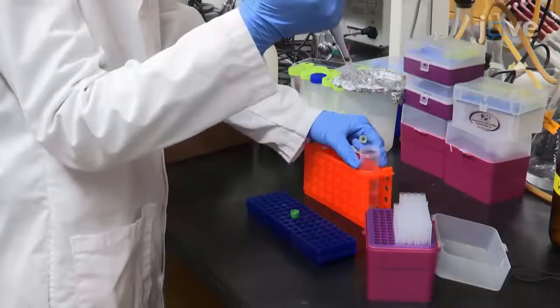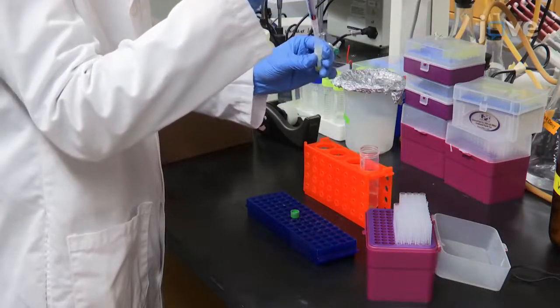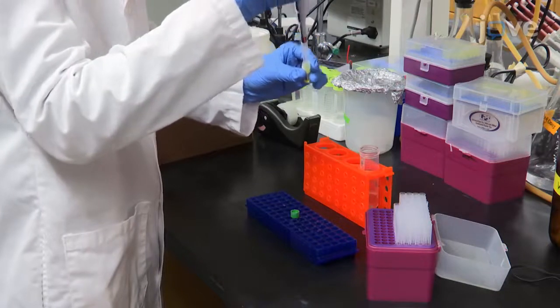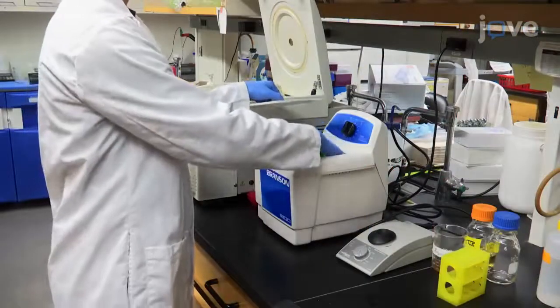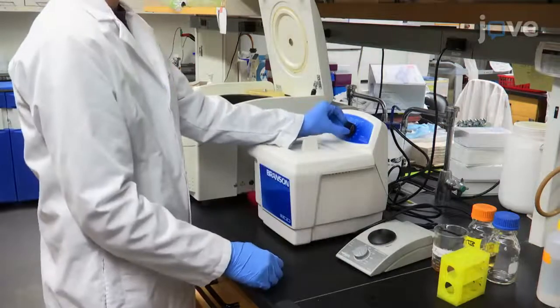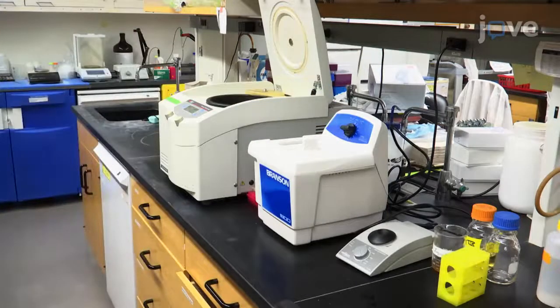Resuspend the peptide according to the manufacturer's recommendations by gently pipetting up and down. For example, resuspend in 70% ethanol to a final concentration of 1 millimolar. If the peptide does not resuspend very well by pipetting, place the tube containing the peptide and the solvent in a sonication bath until it is fully resuspended.